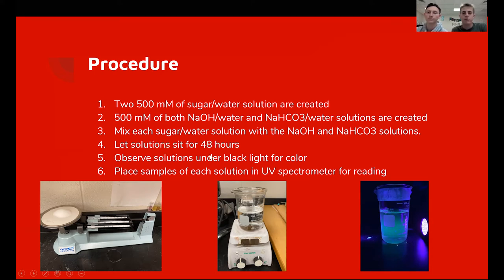And then once we do that, we observe these solutions under a black light and look for their color, see if the quantum dots have formed and what sizes they are. And then after that, we place these solutions in a UV spectrometer for a reading of their absorbance.